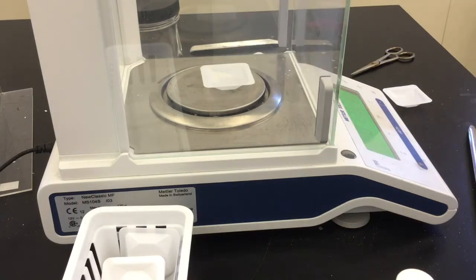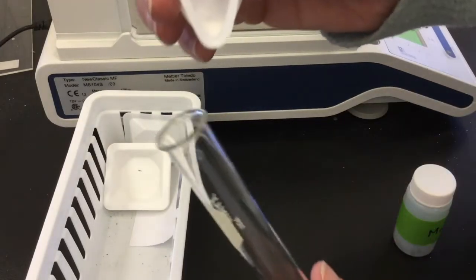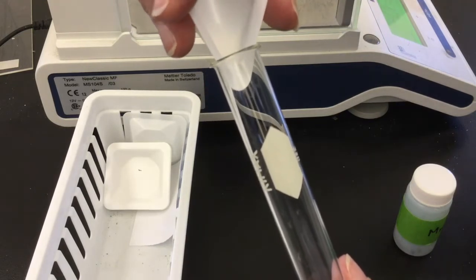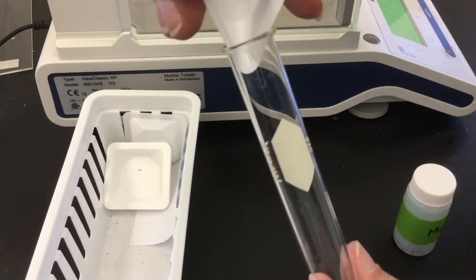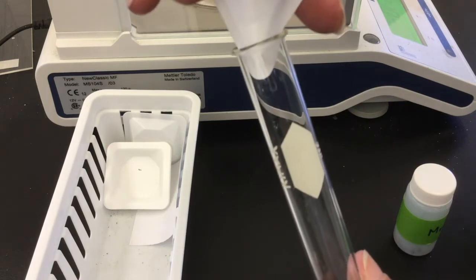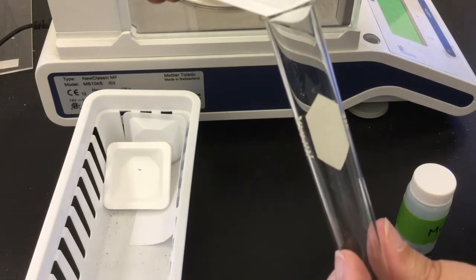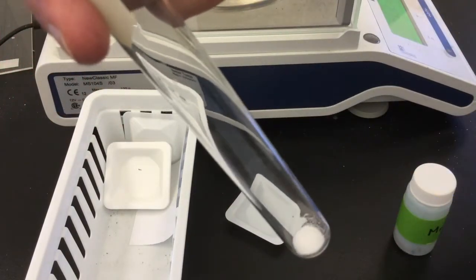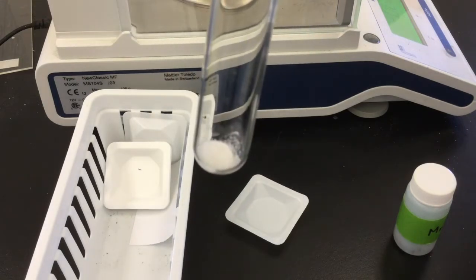Be sure to record all 4 decimal places in your notebook. It doesn't need to be exactly 0.1500 grams, but you do need to know exactly what it is. Once you have weighed out your material, you are going to pour it into your test tube, making sure to bend the weigh boat so that you create kind of a funnel, and tap it down to make sure that all of the powder is removed. Then check the sides to make sure that you don't have any of your powder sticking to the sides and that all of the powder is at the bottom.